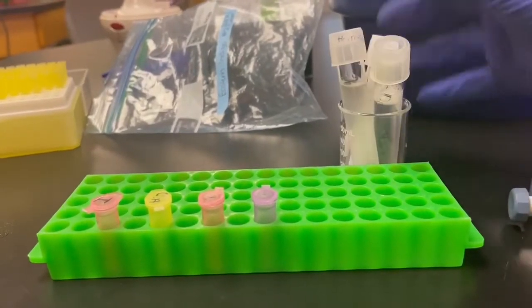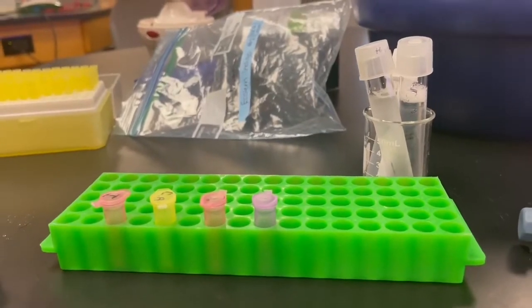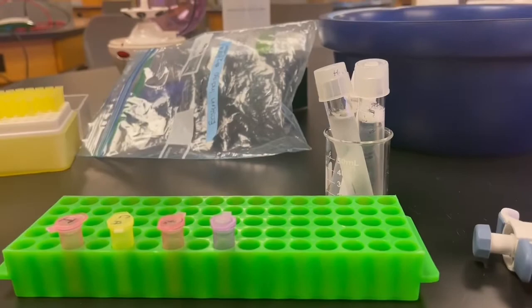A timber rattlesnake, an eastern diamondback rattlesnake, and a cotton mouth. And we will be combining 25 microliters of sample buffer with 25 microliters of each venom sample into the gel well.